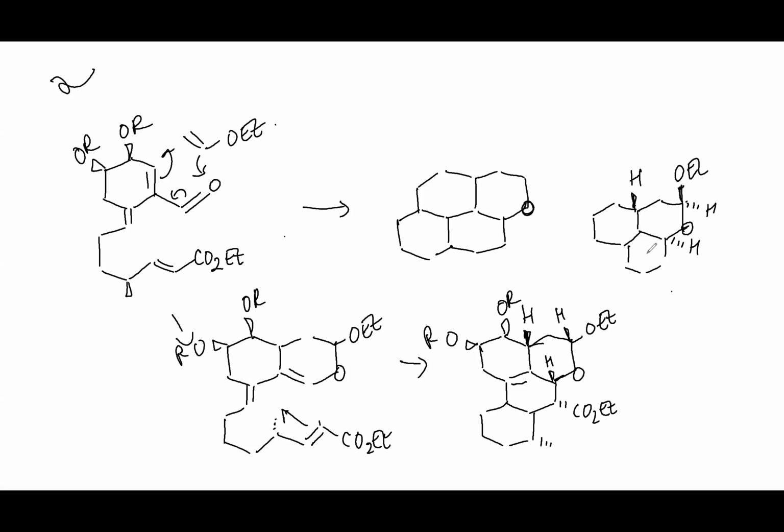This proton here, let me erase this other one, had a relatively high chemical shift because it was in between these 2 oxygens, and it was by itself.